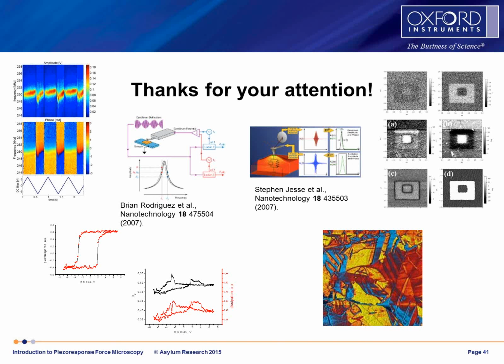Well, it very much depends on the range in which parameter space one considers. Basically, as long as the material is solid and forms a semi-reasonable surface, meaning that it doesn't react with the atmosphere and is more or less stable, pretty much anything. All the way from materials with Young's modulus of about 10 megapascal and up. So from very soft materials, gels, squishy biological systems, all the way to solids.